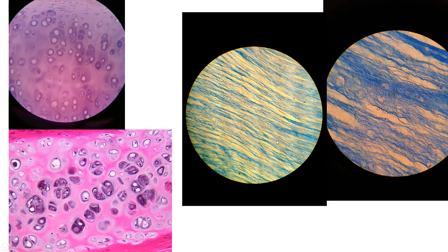This is fibrocartilage, zoomed out a little bit, and this is zoomed in. This is the strongest type of cartilage there is, and we find this where we need lots of strength, like the intervertebral disc, the pubic symphysis, also the menisci of the knee. Again, you have chondrocytes lying in lacunae, and you see the fibers, the collagen fibers.